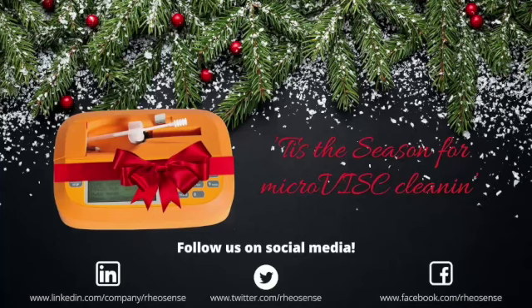Another thing that will help you is the viscosity of your sample. So that's what the last step was for. Just knowing that each of our chips has a different viscosity range that it's rated for. Typically, as you go up higher in viscosity, you're going to want to use larger flow channels, as well as chips that are rated for higher pressures.